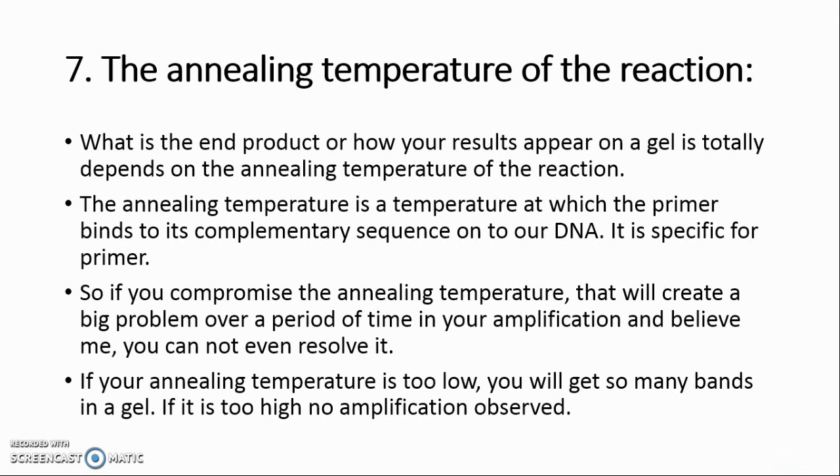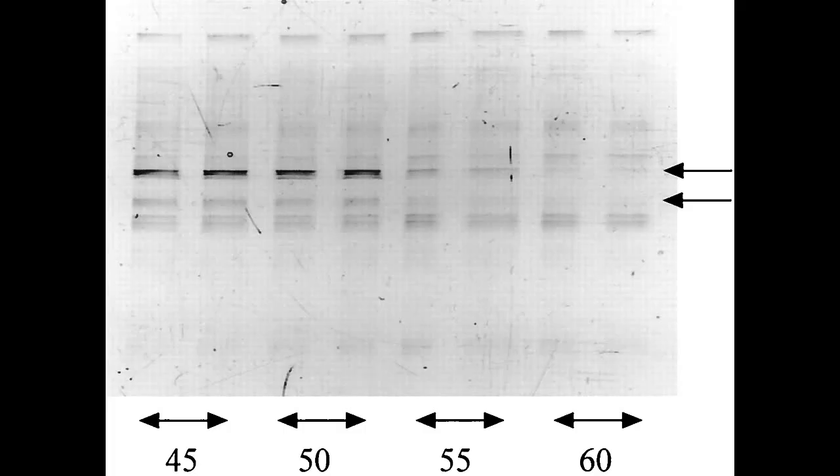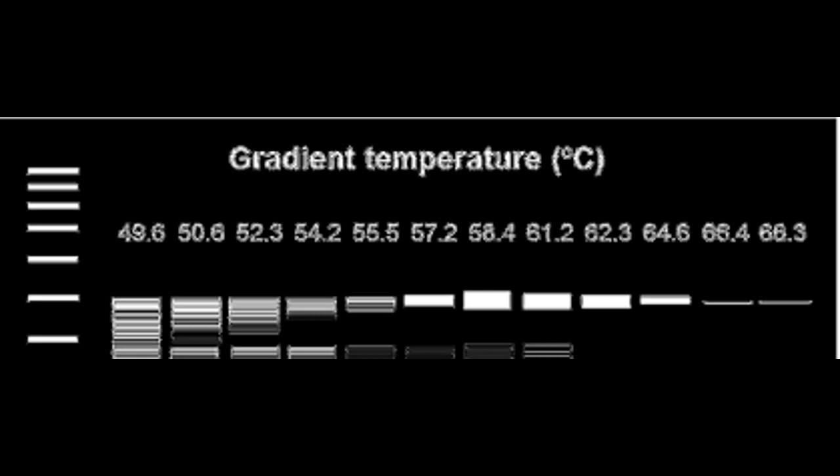Secret 7: The Annealing Temperature. The end product and gel results depend entirely on the annealing temperature of the reaction. The annealing temperature is the temperature at which the primer binds to its complementary sequence on the DNA — it is specific to each primer. If the annealing temperature is too low, you will get many nonspecific bands on a gel; if too high, no amplification is observed. Perform a gradient PCR assay to determine the exact annealing temperature. You can adjust the annealing temperature by adding MgCl2 or DMSO, but this requires a high level of expertise.